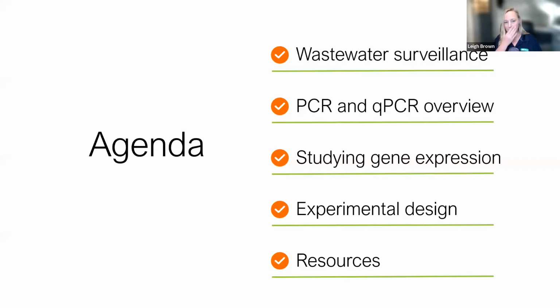So today we're going to start off talking about wastewater surveillance. This is something that you're probably familiar with since COVID, but we're going to go a little bit deeper and talk about ways that we're using it in ways that you might not expect, and also the history of that. We'll get into an overview of PCR. That'll be relatively quick. I'm going to assume that most of you probably have some background knowledge on conventional PCR or endpoint PCR, and we'll talk about qPCR or real-time PCR as well.